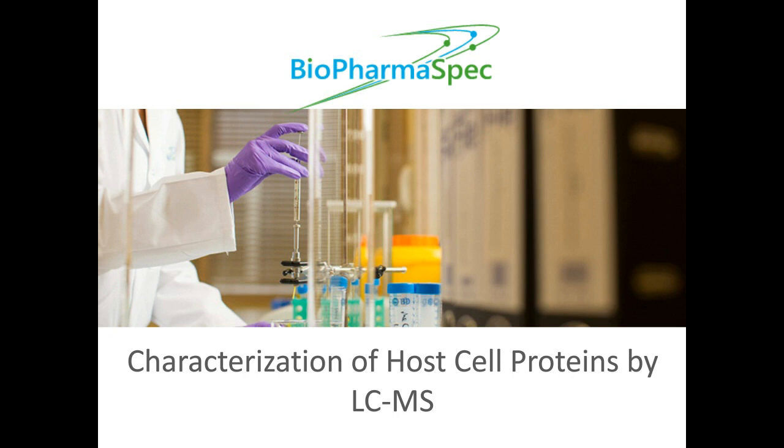Thanks, Eliza. Thank you, everybody, for joining us today. During this webinar, we're going to discuss some of the advantages and disadvantages of ELISA analysis for the detection of host cell proteins, and how LC-MS can be used as a complementary orthogonal approach to ELISA. We'll also discuss our workflow for LC-MS analysis of host cell proteins. And at the end, we'll summarize everything we discussed today and have a short Q&A session.